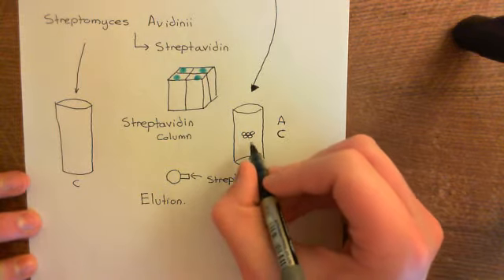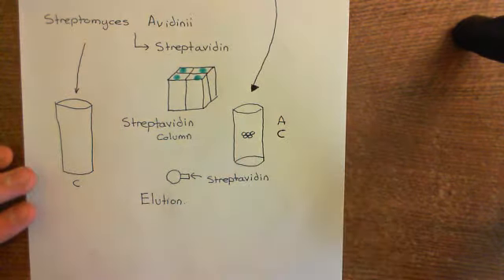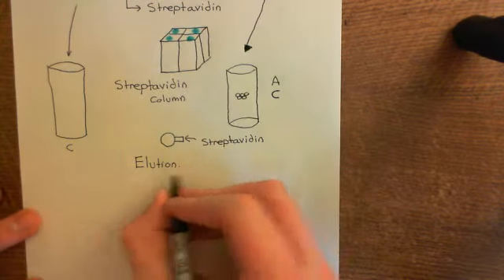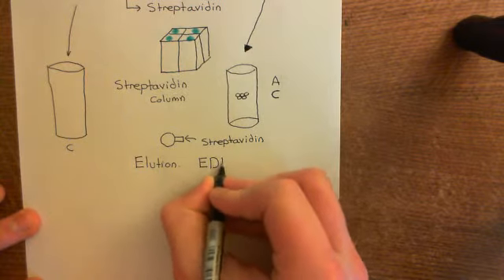And you will collect the proteins in both cases, both the control and the non-control. You will collect the proteins that come through when you elute. Okay, so what do you use to elute? Well, basically, you usually use a molecule known as EDTA.